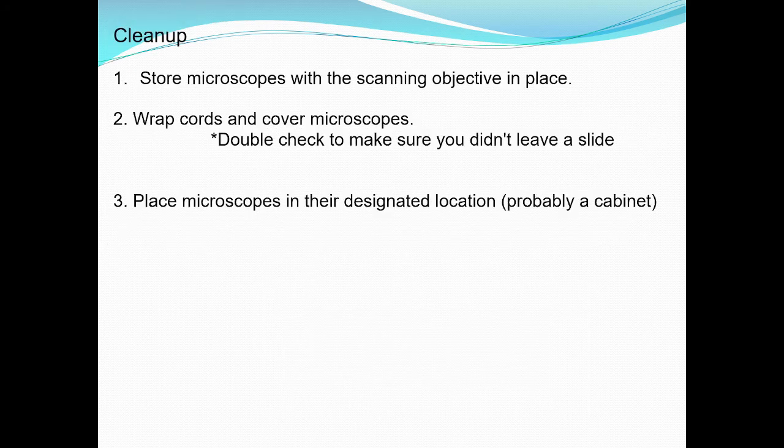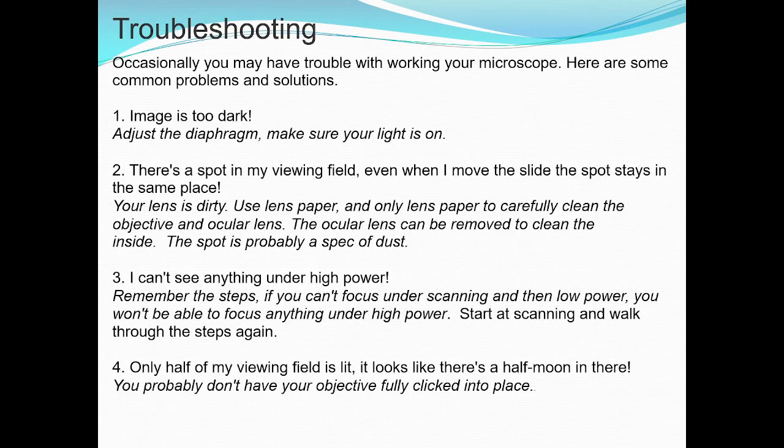When cleaning up, store microscopes with the scanning objective in place. Wrap cords and cover microscopes. Double check to ensure that you didn't leave a slide. Place microscopes in their designated location. It would be safe if you place it in a cabinet.